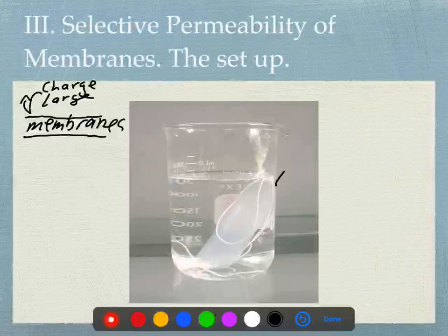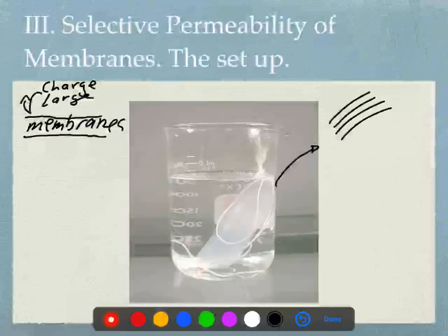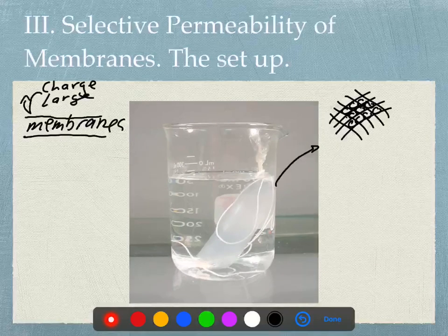All right, again, this is in the case of membranes. But what about the case of the dialysis tubing? Okay, the dialysis tubing is made out of cellulose. Remember that that's plant fiber. So we have technologies now that allow us to take fibers, cellulose fibers, and weave them together in such a way that these fibers can be interwoven so that there's these little pores now.